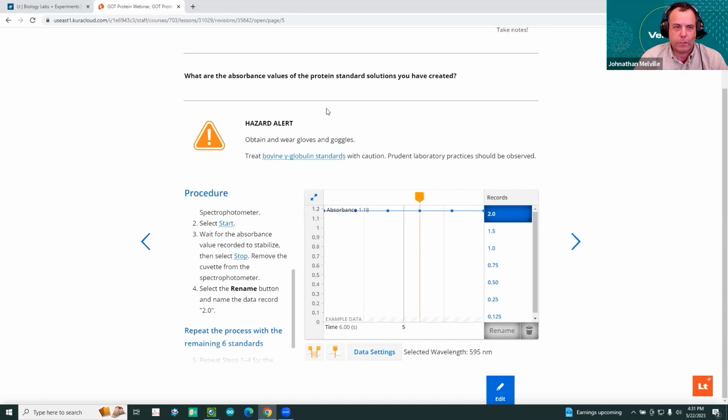Let's see, someone had a question in chat. Does the SpectroVis Plus work on Chromebooks? The GoDirect SpectroVis Plus works on everything using our software. So it will work on Chromebooks, iOS, Android, PC, and Mac. It's just LT, the platform that we're showing you right now. Live data collection only works on PC.